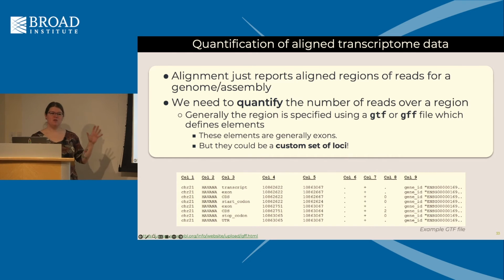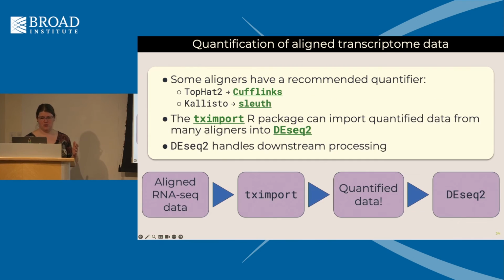And so here's the thing, you can take a GFF or GTF and drop yourself into R or whatever your favorite systematic manipulation program is. If you have a region that you think is expressed, or a particular intron or exon, and you want to know how many reads show up over that, or let's say you put GFP in as a reporter and you want to know how expressed it is, just add that entry in. You can totally do this yourself. And I think that's really cool and really powerful about this format. It's easily human manipulable.